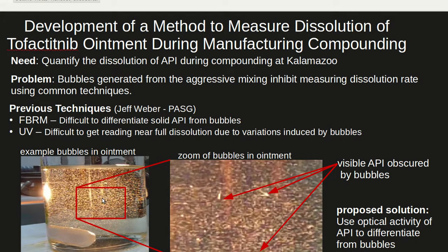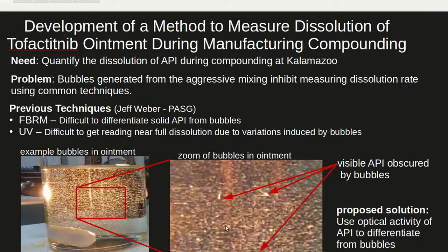The image on the bottom left shows a representative example of the tofacitinib ointment with all of the air bubbles. The image on the right shows a magnification of the image. Careful inspection shows the presence of undissolved API particles which are difficult to discern with all of the air bubbles.